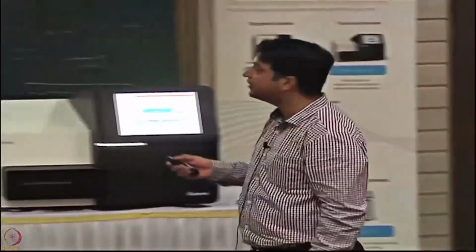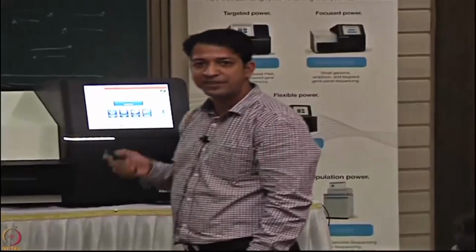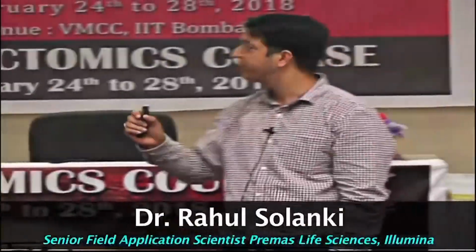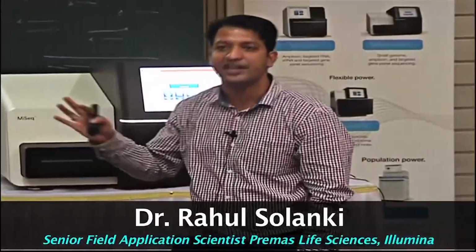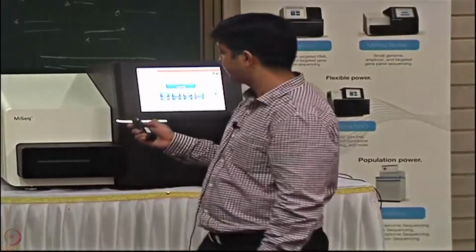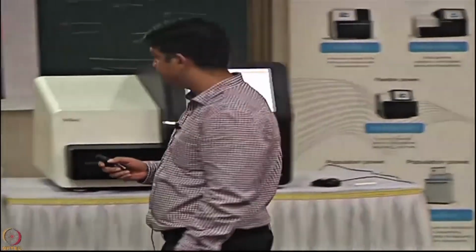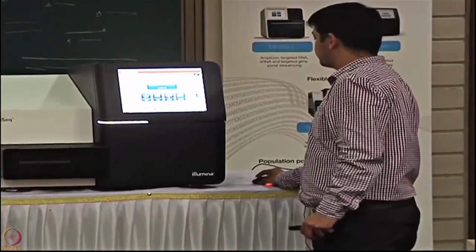What you need to understand is, what is primary analysis? During primary analysis, the intensities of the base calls are extracted and you will get .bcl files on board. During secondary analysis, you will get all alignments and FASTQ files. Right. So I'll play a small video for you guys. I hope it will clarify everything. The same thing which I have shown will be shown sequentially.